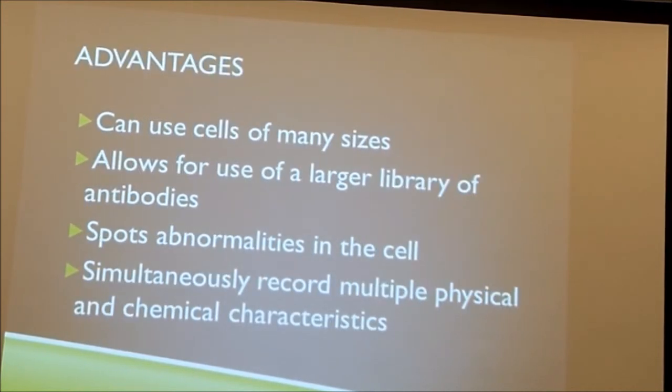Some of the advantages are that you can use cells of many sizes, you can use a large library of antibodies, you can spot abnormalities in the cell, and you can simultaneously record multiple physical and chemical characteristics of the cell.